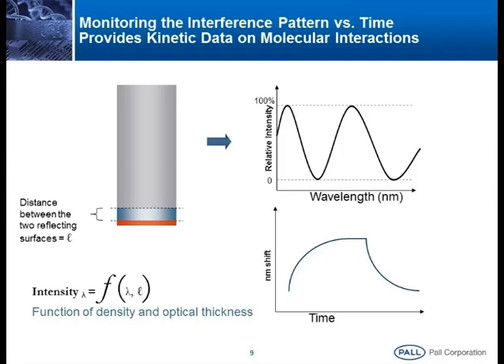Now, it starts dropping in the dissociation phase. If it is like this, we call it a moderate interaction. If it is a strong interaction, like a straight line from here, we call it picomolar affinity. What exactly is picomolar affinity, nanomolar affinity or micromolar affinity?